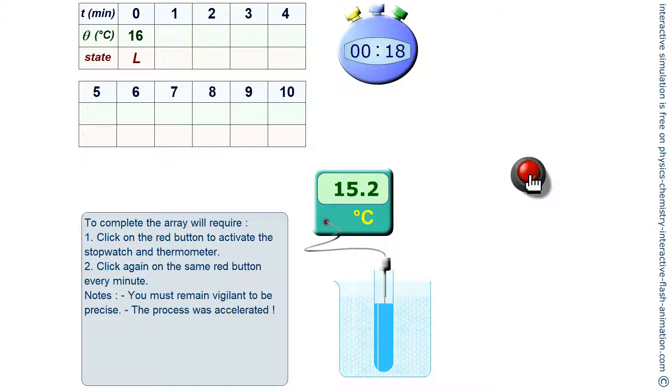So, we expect the temperature to decrease. Indeed, we see that the thermometer here is showing a decreasing temperature.